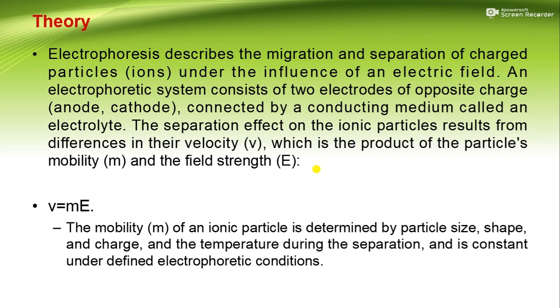v equals μE. The mobility, μ, of an ionic particle is determined by particle size, shape, and charge, and the temperature during the separation, and is constant under defined electrophoretic conditions.